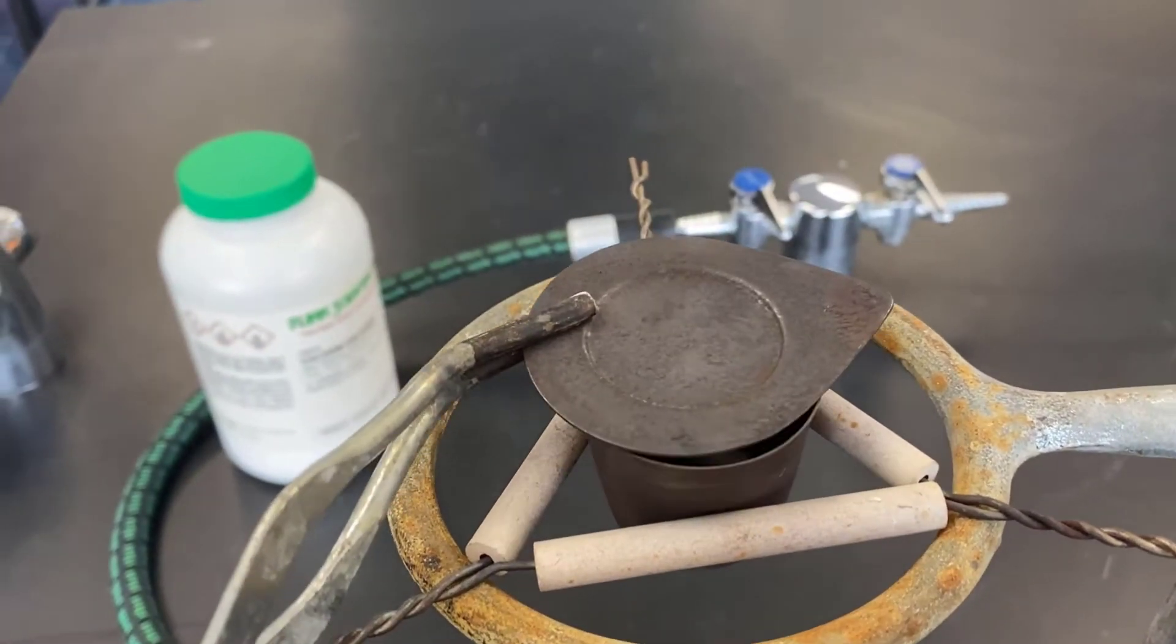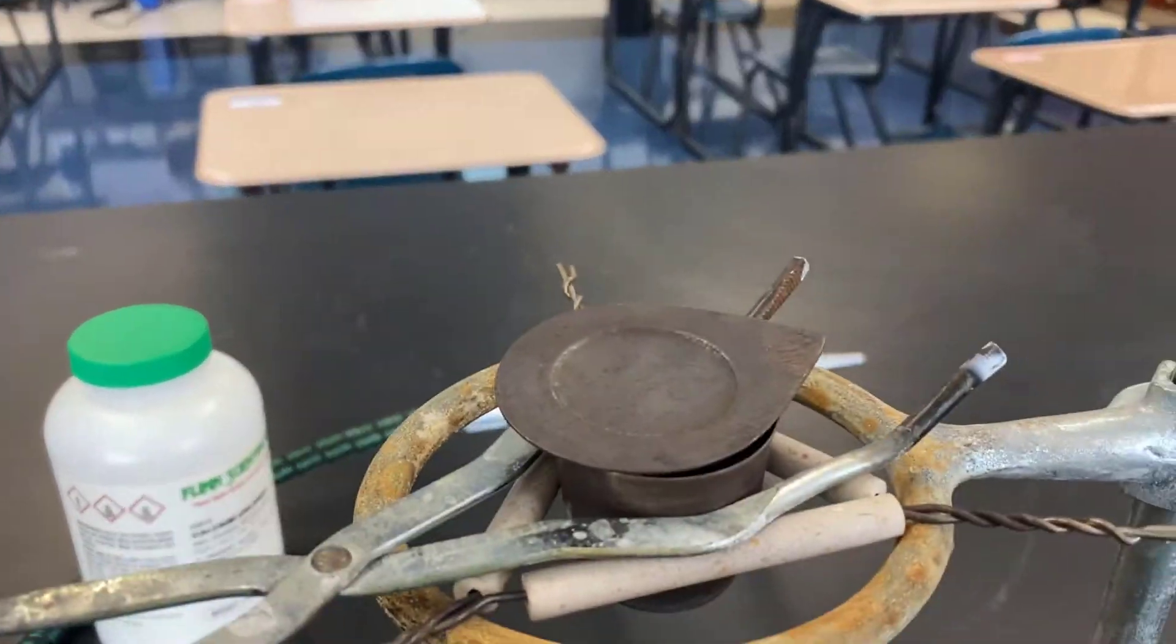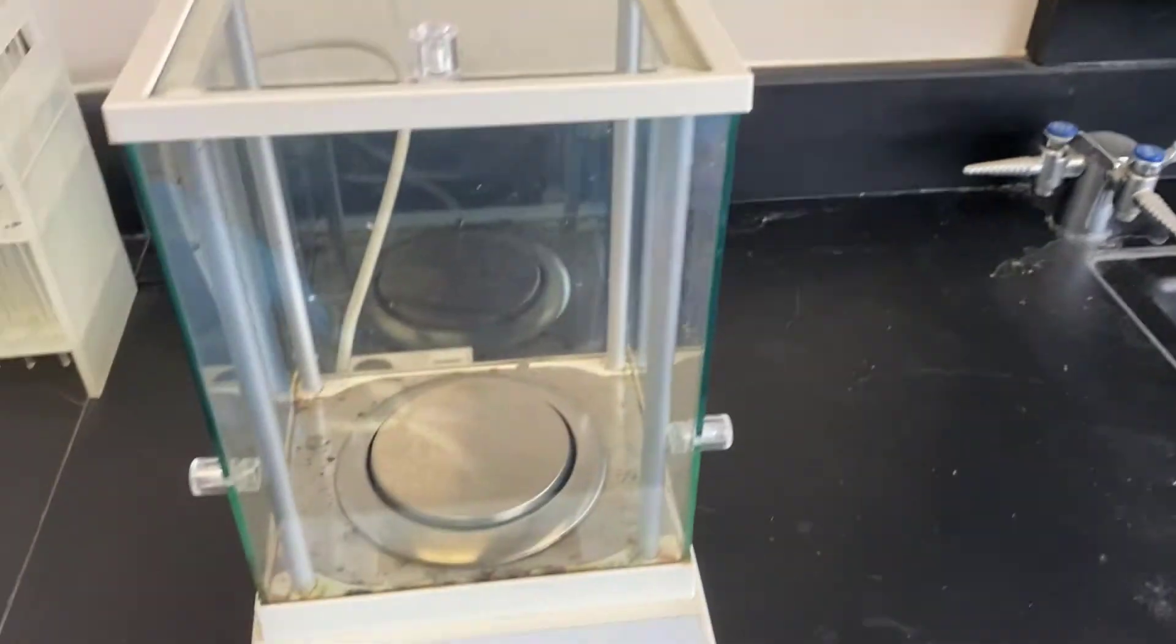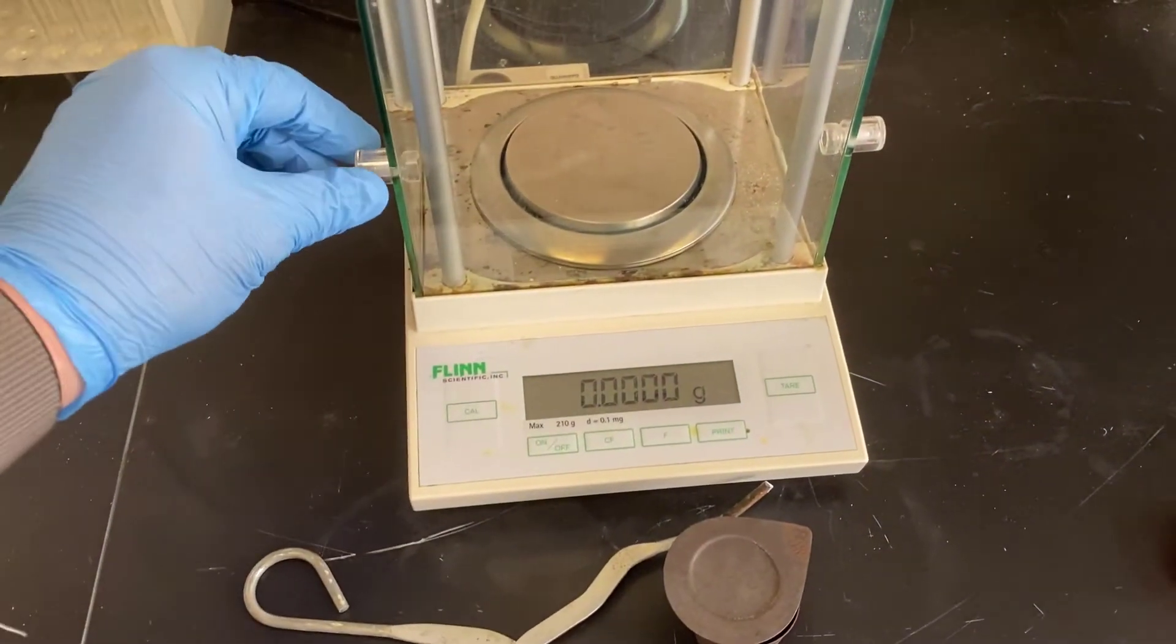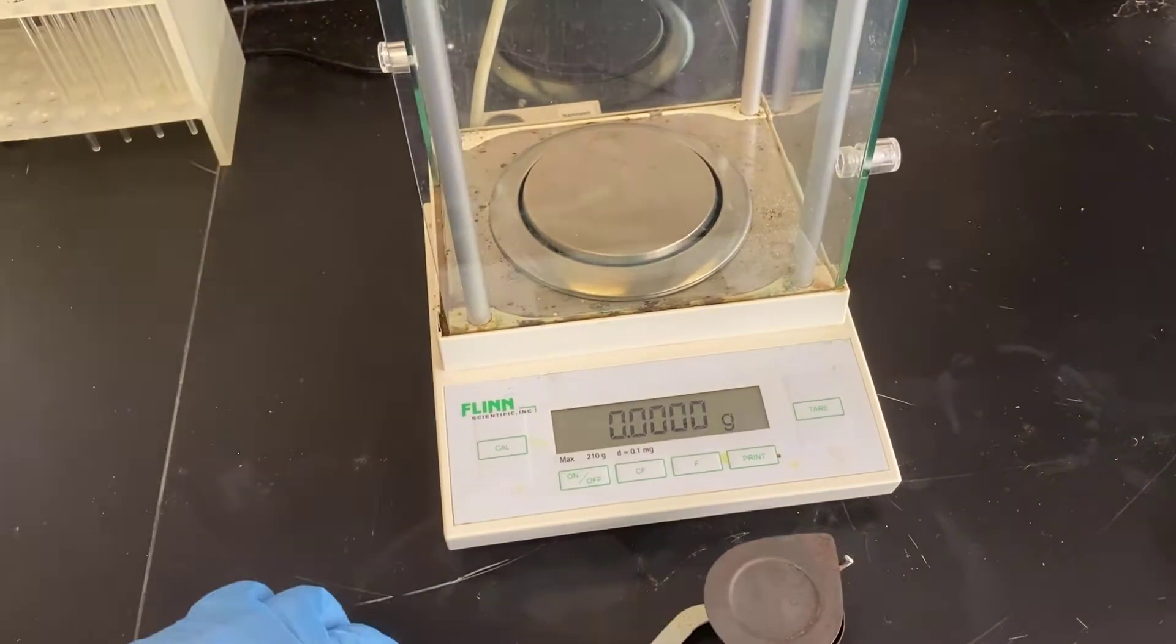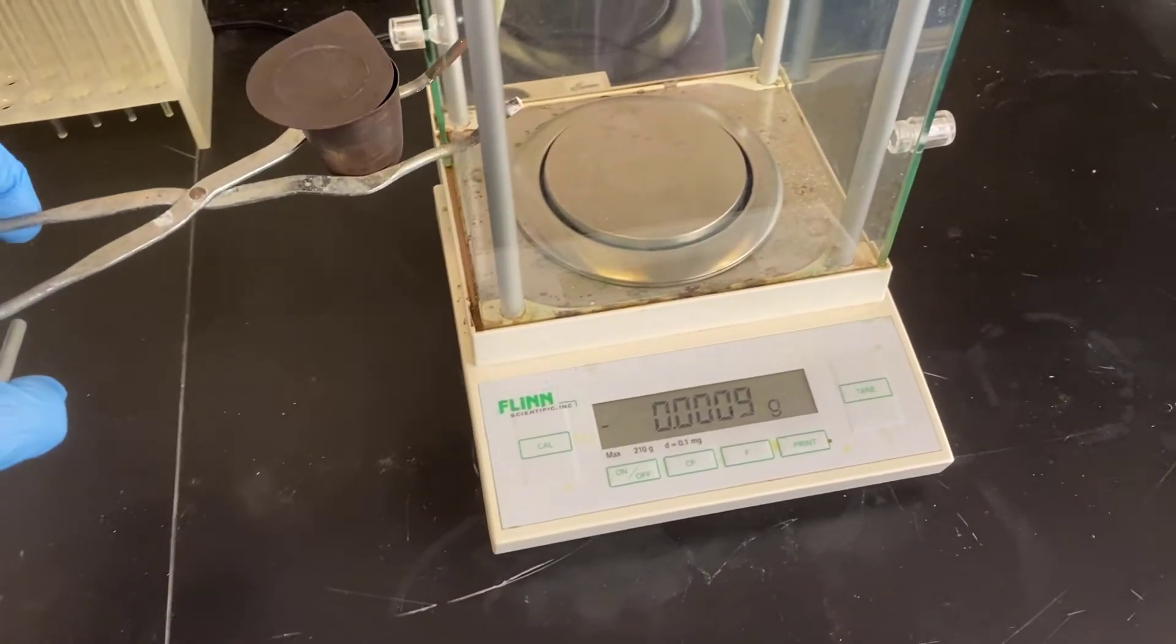Again, once it's cooled, we'll be able to go ahead and get its mass. The hope is that all of the water has left. If you watch the heating, you'll notice that we only left a small gap between the crucible and the lid so that water vapor could escape. The mass loss should be water.